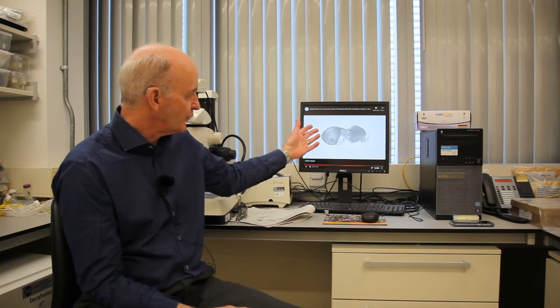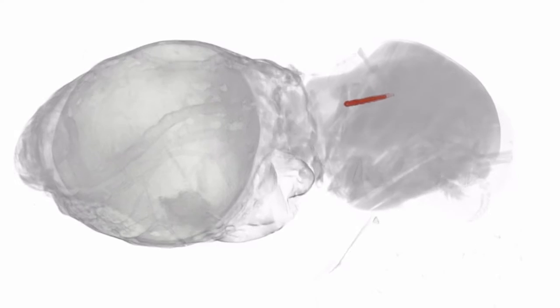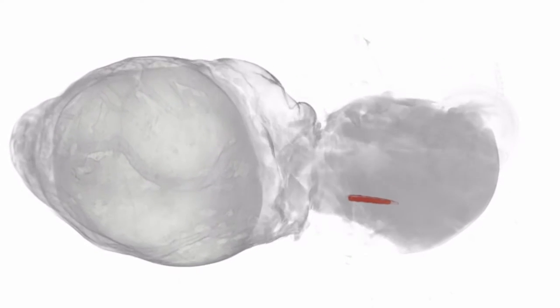see it on the screen, and that red object, the cylinder in the thoracic flight muscles, is a first stage larva of Onchocerca, and basically visualized in 3 dimensions for the first time.